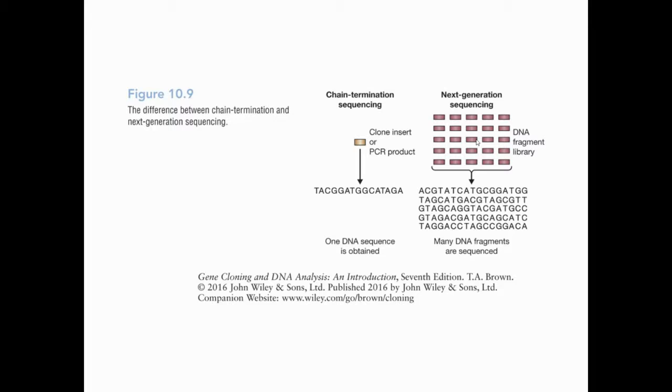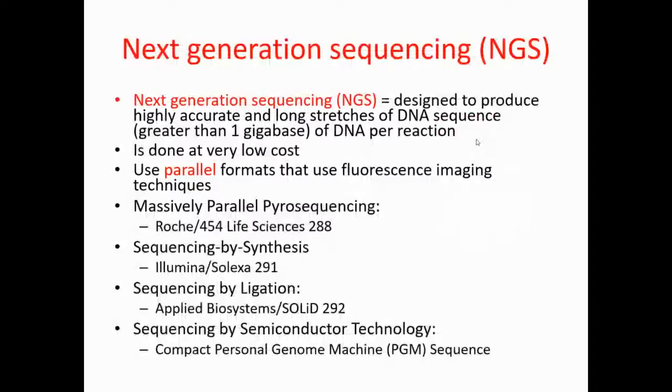And also because of the Human Genome Project in the late 90s and early 2000s, people started thinking how to develop sequencing technology to simultaneously sequence hundreds at a time, and that's why we developed NGS. Also, we completed the human genome draft in the early 2000s, finishing the whole human genome sequencing. Okay, and so the development of the NGS, as I say, early 2000.